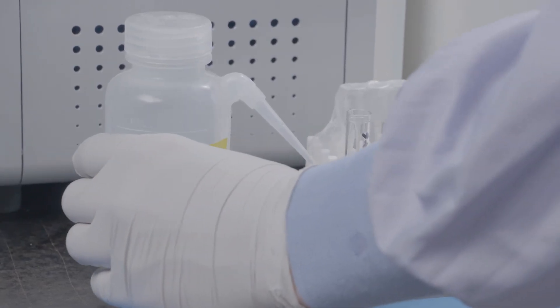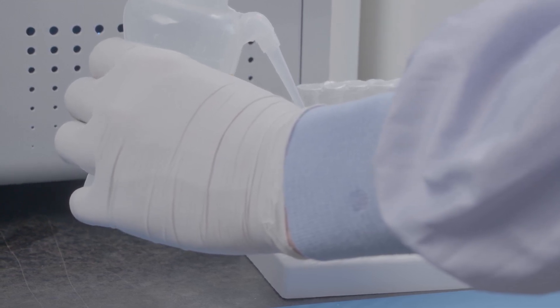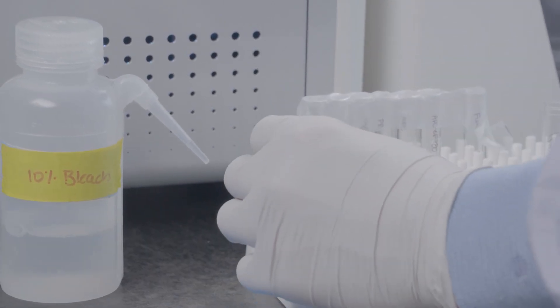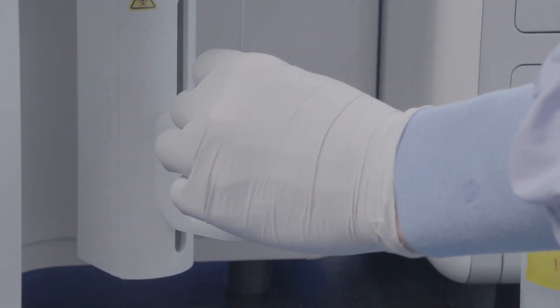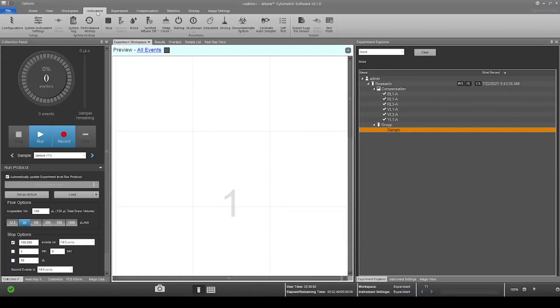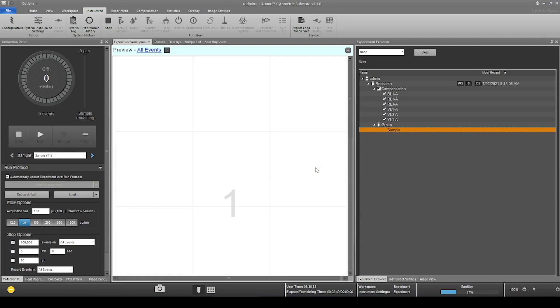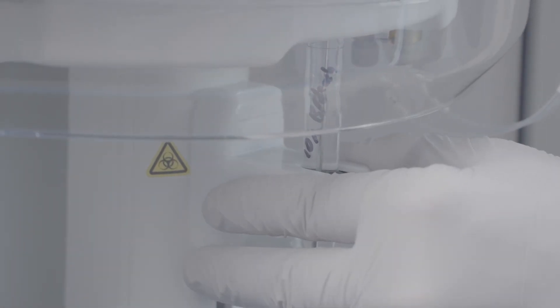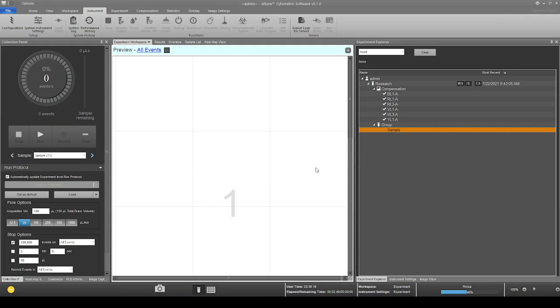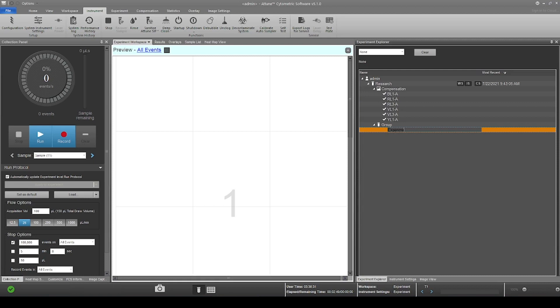Now you may choose to sanitize the sip tube and clean the system prior to running your experimental sample. Load 10% bleach into the sip tube. Then select instrument in the menu bar and select sanitize Attune sip. When complete, lower and remove the sanitize tube, then follow the prompt to rinse the sip tube. Now the Attune SightPix flow cytometer is sanitized and rinsed.